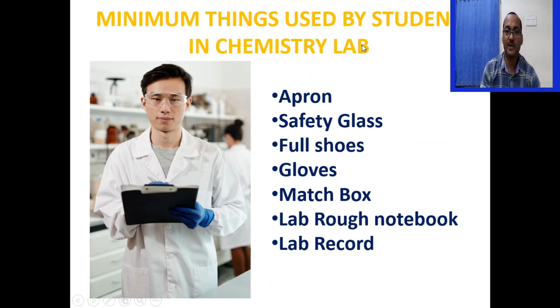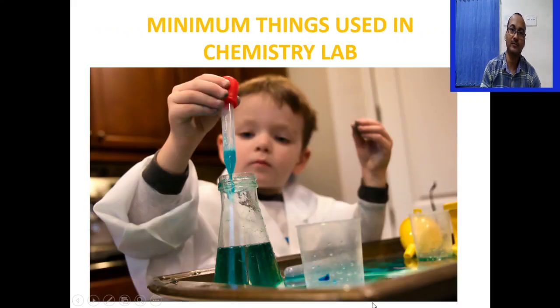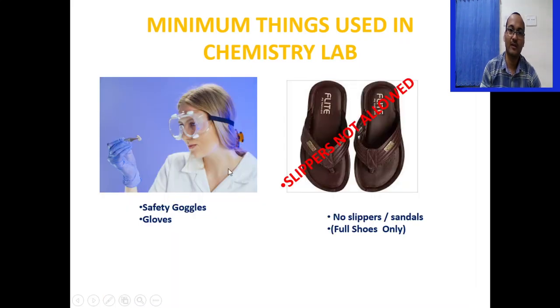These are the minimum things a chemistry student must use inside the chemistry lab: apron, safety glasses for eye protection, full shoes, gloves, matchbox, lab rough notebook, and lab record. The student must wear an apron. Safety glasses and gloves are mandatory. No slippers or sandals inside the chemistry lab — always wear full shoes because acid spilling on your leg can damage your skin.